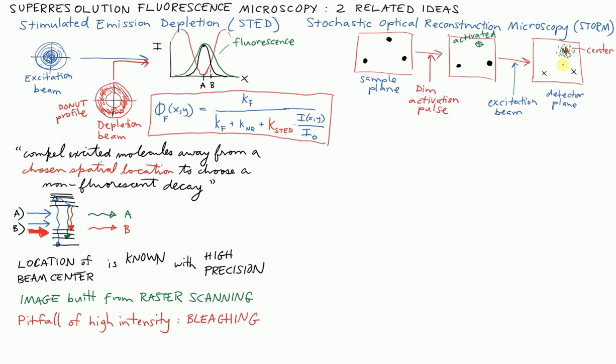If I were to say this in English to match this sentence here, what I would say is that we only allow a few isolated molecules, one of which we saw here. We only allow a few isolated molecules at, instead of a chosen spatial location, now we are having it be at a chosen time interval.